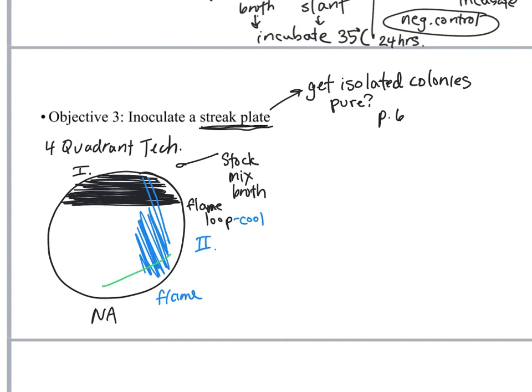Once again, flame your loop. For quadrant three, once again, scrape across all of that previous quadrant two. Hopefully you're getting the idea here and then you're going to flame your loop and right here. Then for the fourth quadrant, what students tend to do sometimes they might go like this or like this and totally miss that quadrant. A lot of students, sometimes they'll do this. That's not good either because you're pulling cells from that previous quadrant all the time and you're not going to get the cells spread out enough. So ideally you're just getting a couple of streaks, remember, from that previous quadrant and then not touching it again.